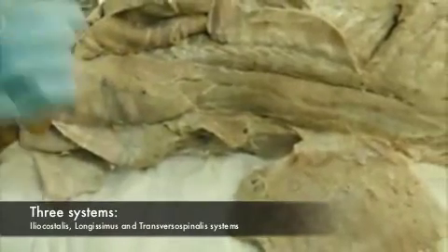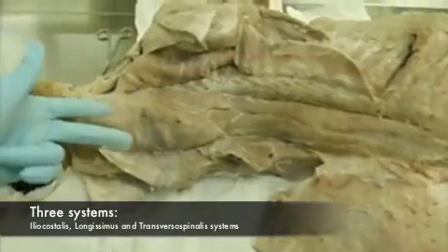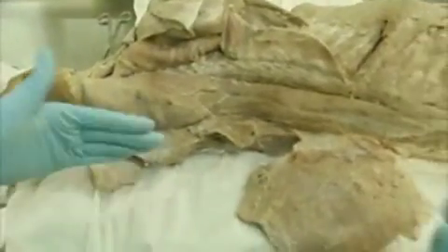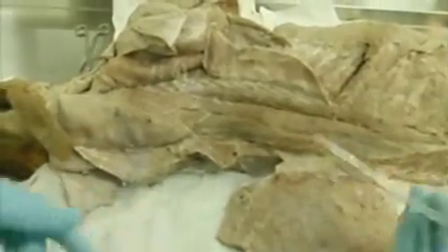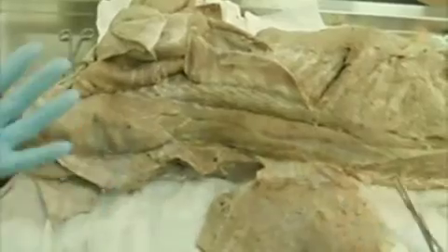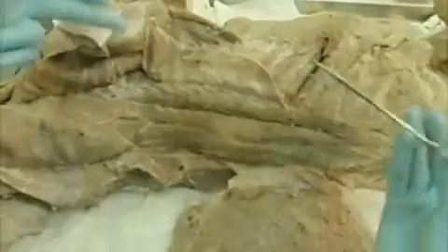There's the iliocostalis system, the longissimus system, and the transversospinalis system. Let's start with the most lateral. That is your iliocostalis. If you get confused with which one is which, think iliocostalis. I think that's how I remember it. Costal means ribs. It's kind of closer to the ribs. I don't know why that makes sense in my head, but it does. It reminds me that it's the most lateral one.